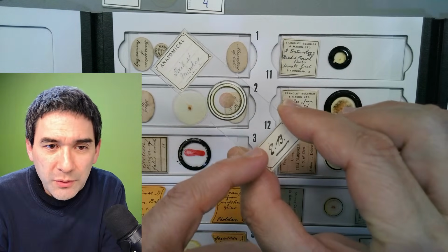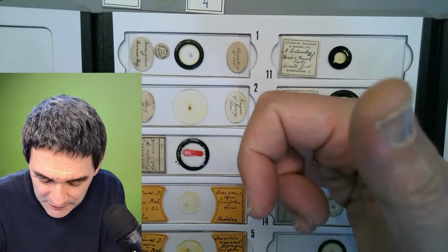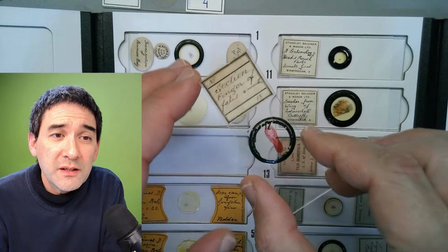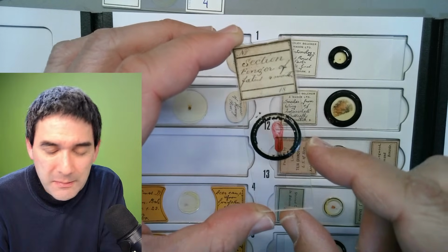Unfortunately, I don't know what the numbering down here means. I just want to show you that here. And this one is definitely not quite as nice to look at, but it's the most unique one that I have. It's a finger of a fetus, of an unborn baby.